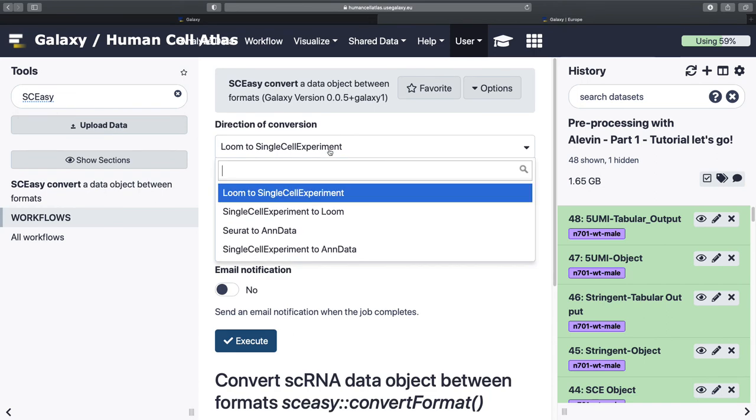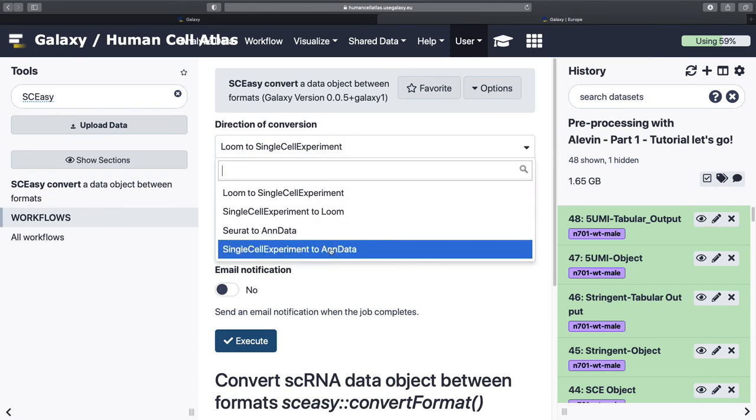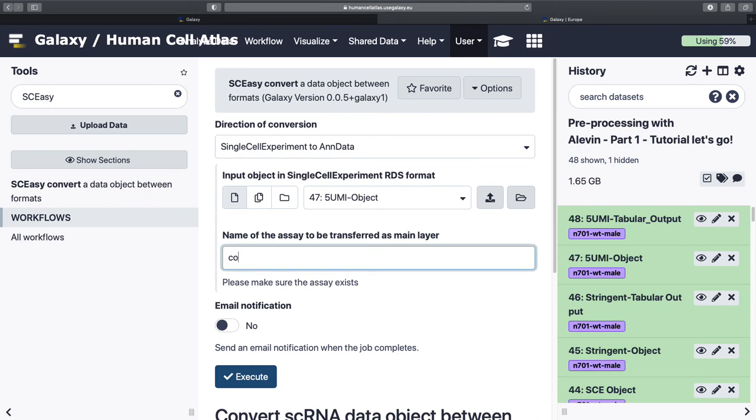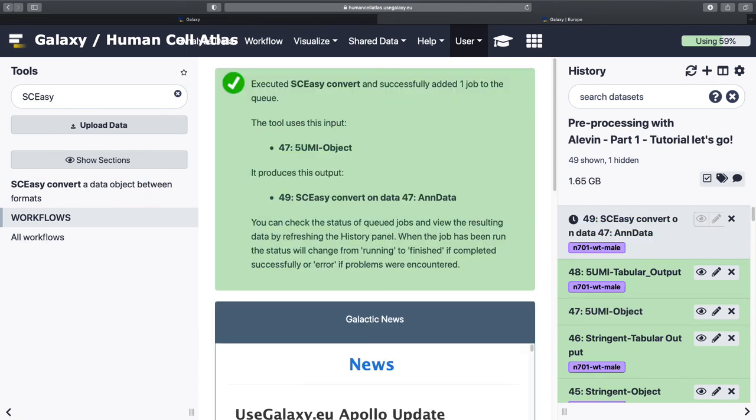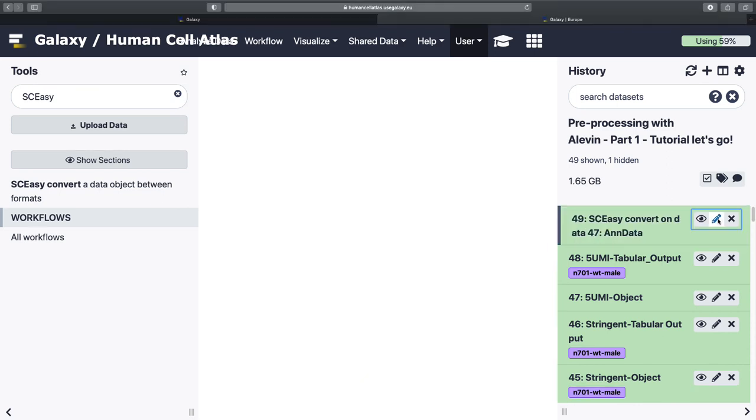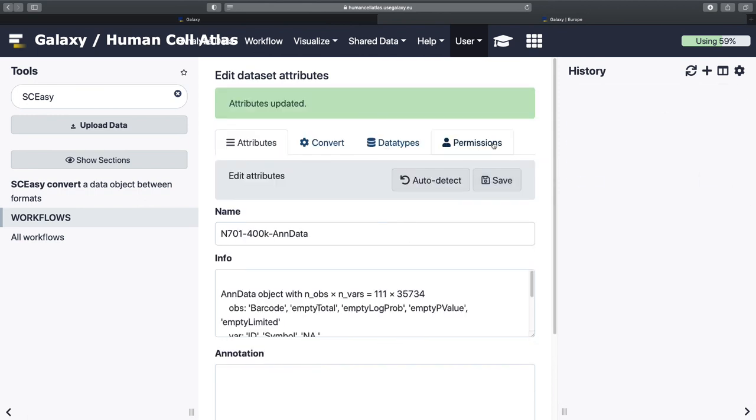And so I should have around, well, hopefully around exactly 111 barcodes. Cool. This is great, but not the right format for the thing I want to do. Come to me. And so I'm going to go single experiment and data. That's what I want. And we're finally there. We have our AnnData object and we can move forward with our lives. Huzzah.